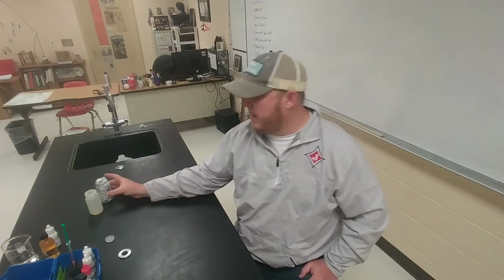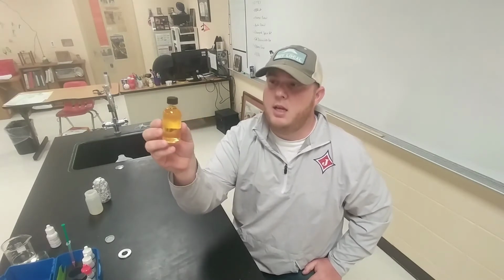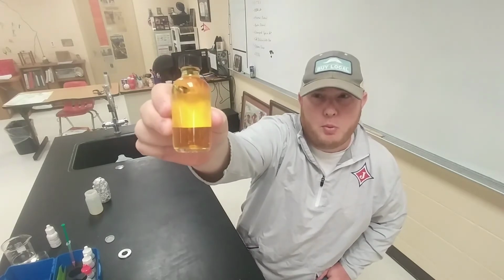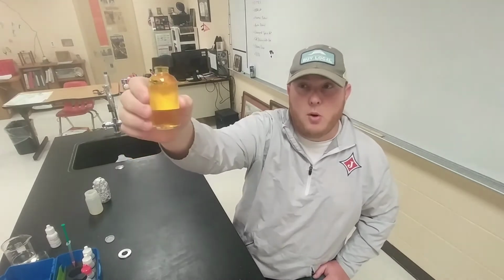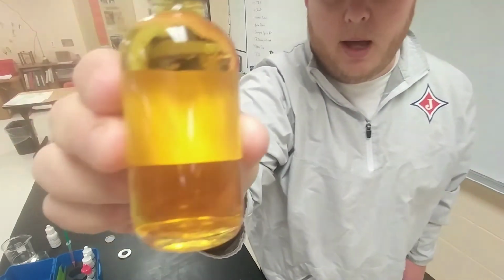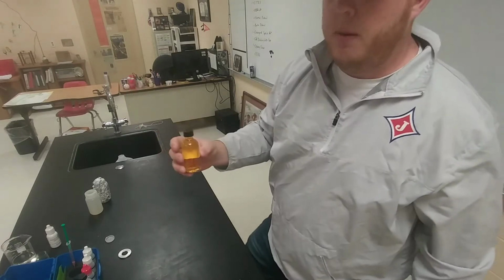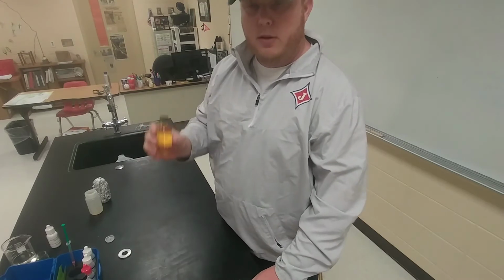So what I have done is I took the water out of this bottle, and I have started to do the DO test, and I've fixed the oxygen in the sample bottle here. I don't know if you can tell, but this is probably a little bit lighter than the sample we got before, as expected. The little red flakes you might have seen in here before were a lot easier to dissolve this time than previously. So this sample has already been fixed. We're ready to go and do the titration at this point.